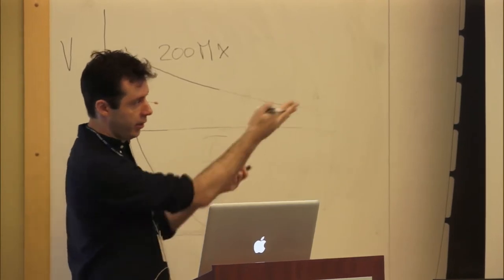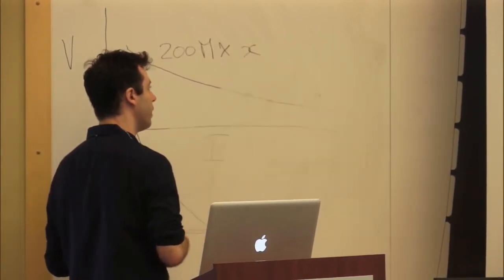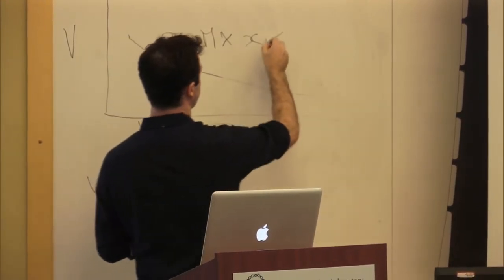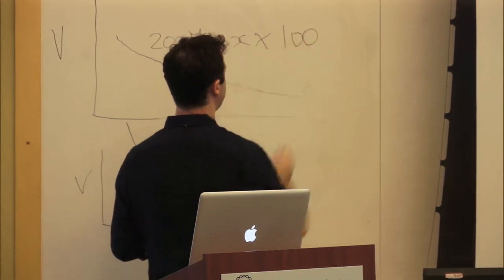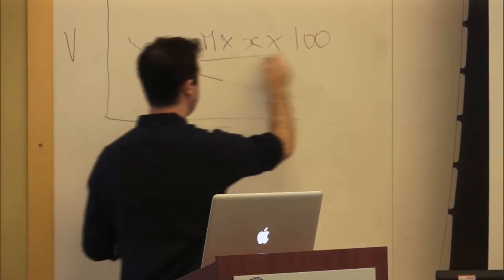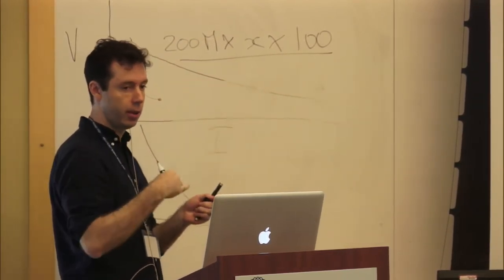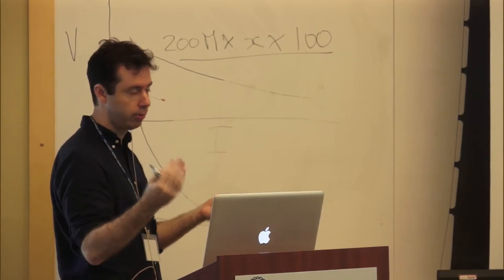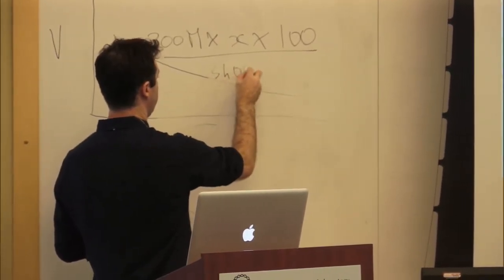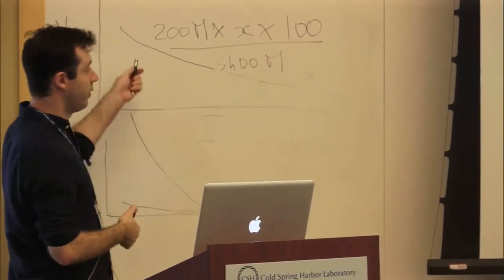The number of lanes in this equation here, let's say it's an unknown. Right. You sequence reads that are 100 base pair long. Each read. So this is how much you sequence. And basically, this is the amount that you meant to sequence at the bottom. So it's 3.4 billion nucleotides. And this gives you the coverage.